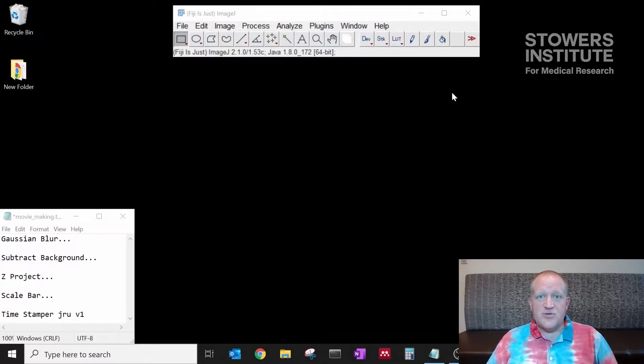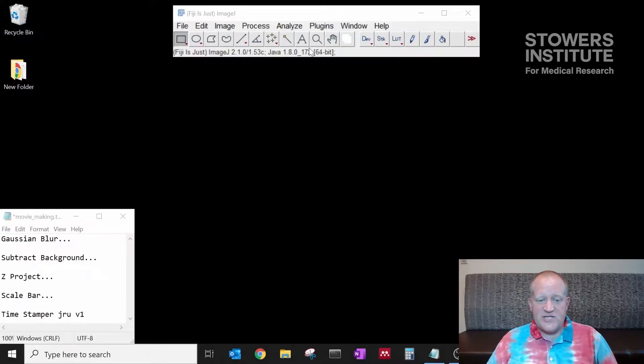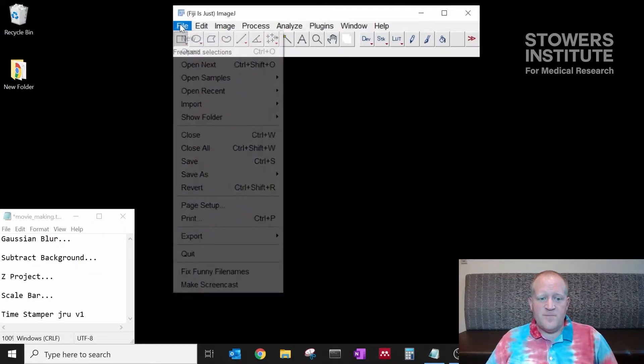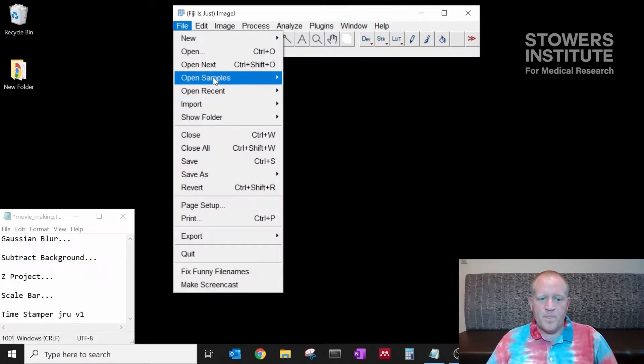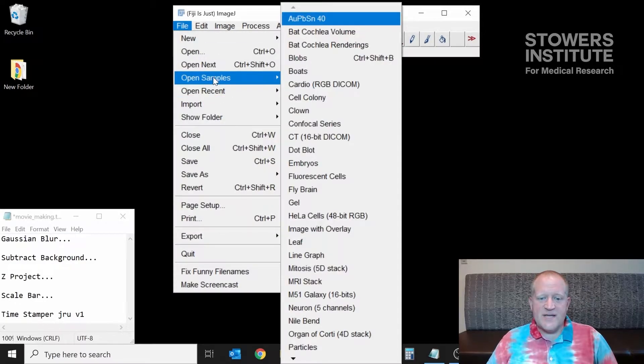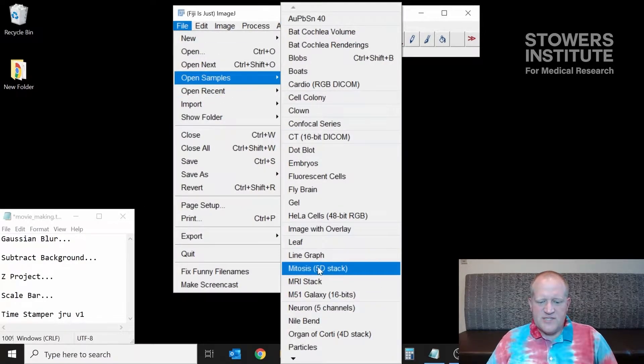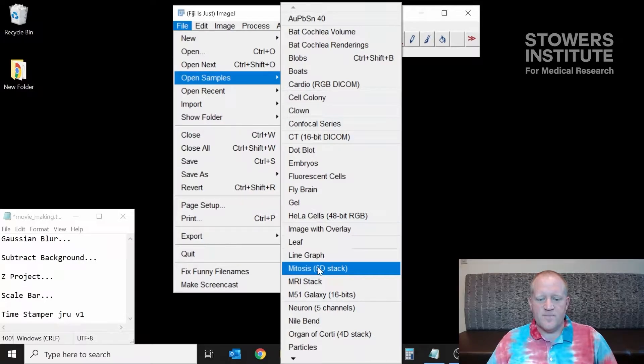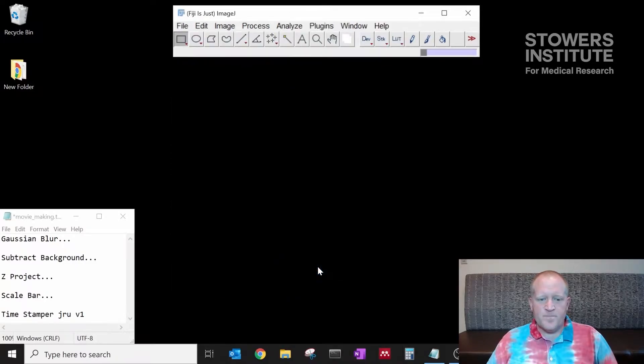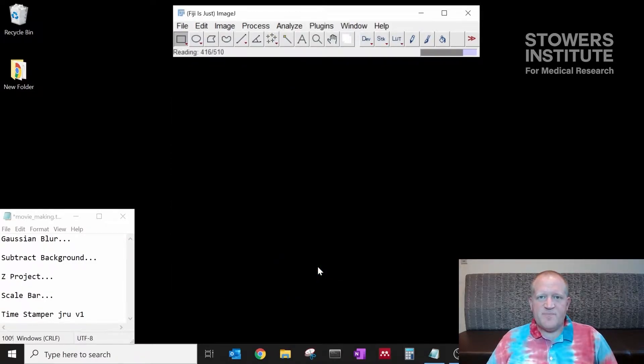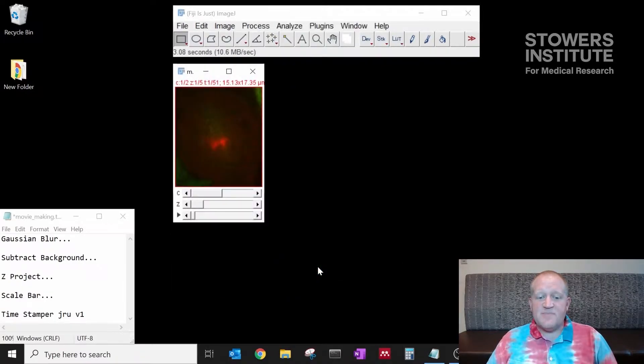To do this we're going to open a sample from Fiji. We do that by going to file, open samples, and we're going to use the mitosis stack here. This is the data that's built into Fiji already.